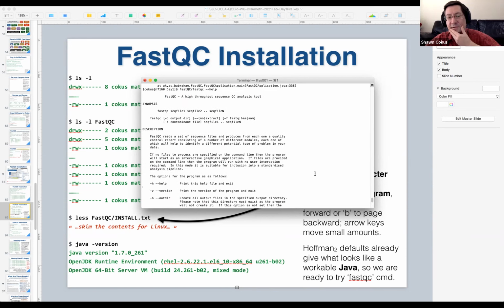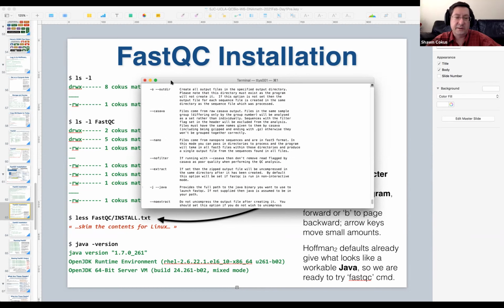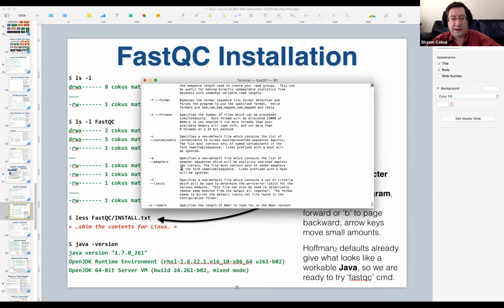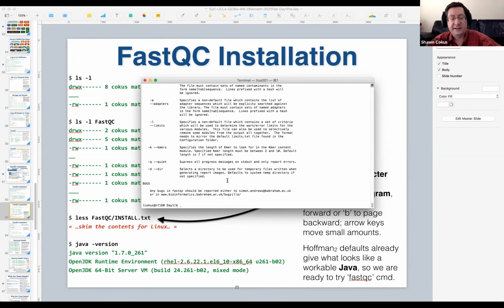So there is more of the usage intended for command line. This one executable is designed both as a GUI program and as a command line program. Without arguments, it runs as a GUI program. So here we go. This is the little mini help, and basically you just give it command line arguments, which are the sequence files you want, and then there's a whole bunch of arguments that are all optional. There's really not even that many parameters to this thing.